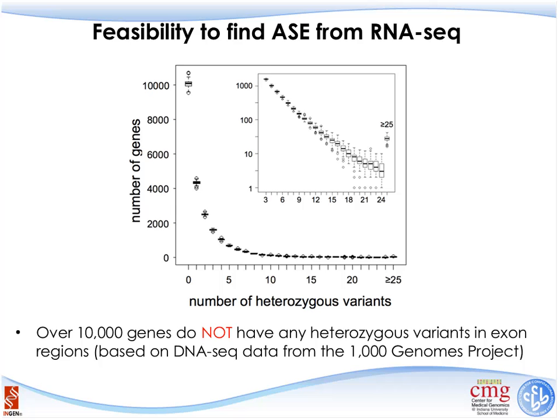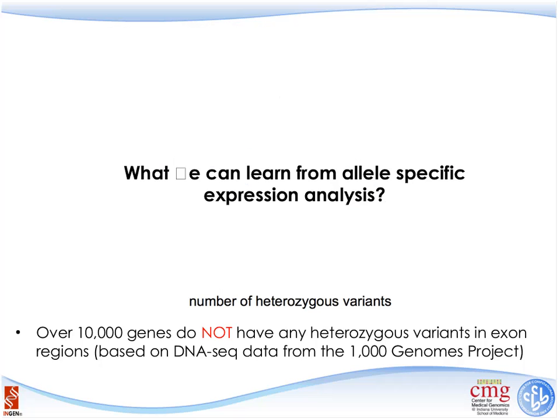So these are the considerations you might need to have before you think of using RNA sequencing data to do allele-specific expression studies. Okay.